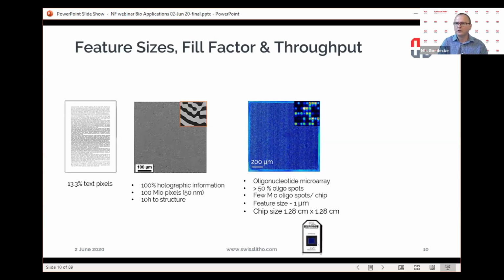They used to show all the details, so I put together what I could find out. So right now you have 6.5 million different oligos on top of a small chip the size of a fingernail, okay? But only 50% is used, because if you make the fluorescent dots too small, your scanner will have a hard time picking them up. So there is a limitation.